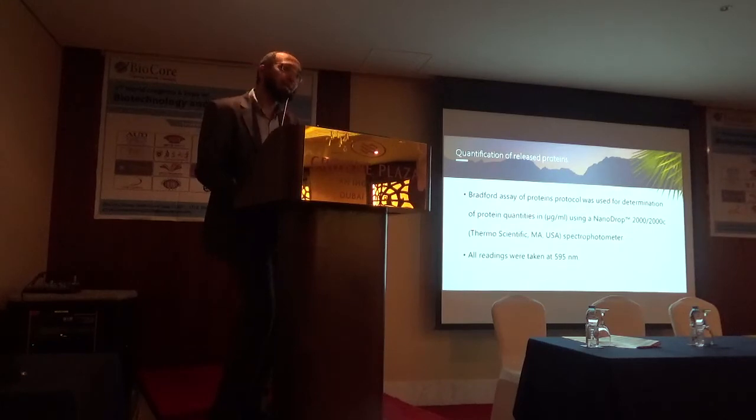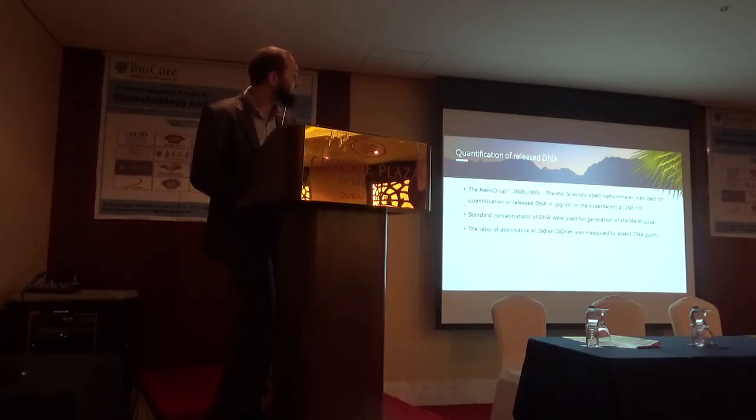In order to analyze proteins and DNA we used a specific protocol called the Bradford protocol for analysis of protein. It's a very famous protocol. We used a device called NanoDrop in order to quantify proteins in addition to DNA. All results were taken at 595 nanometers. In the same way, we used the same NanoDrop device to quantify DNA quantities.